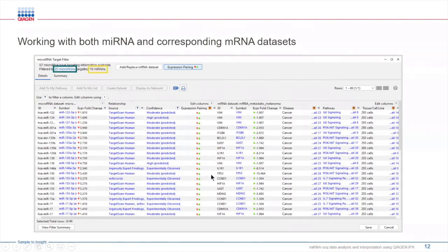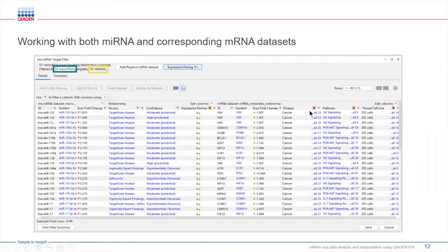With IPA, you can easily narrow down your target mRNA list based on biological content and expression patterns.